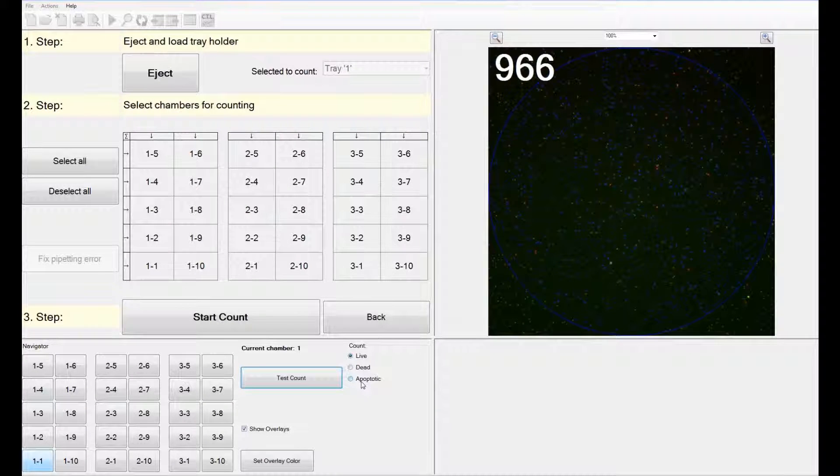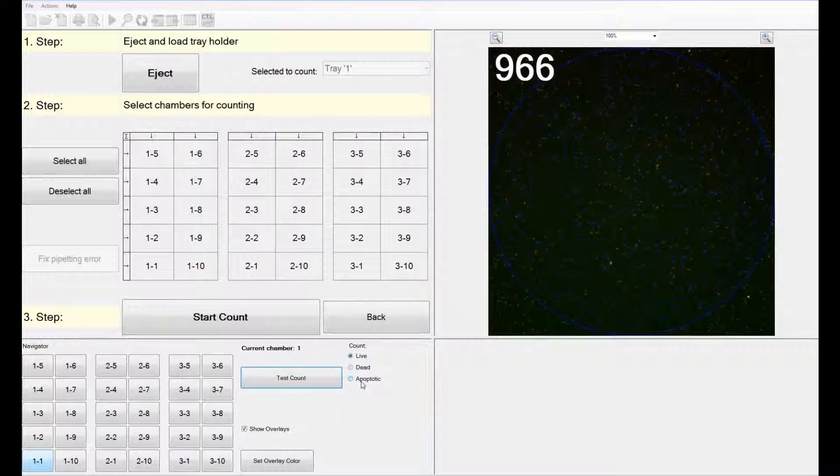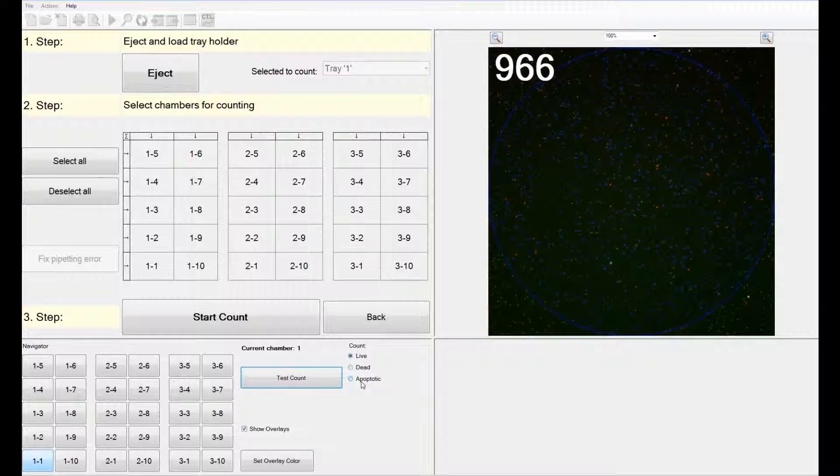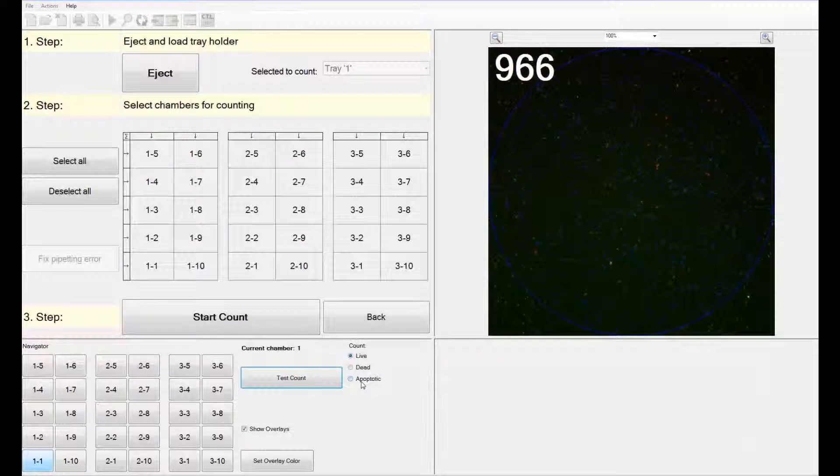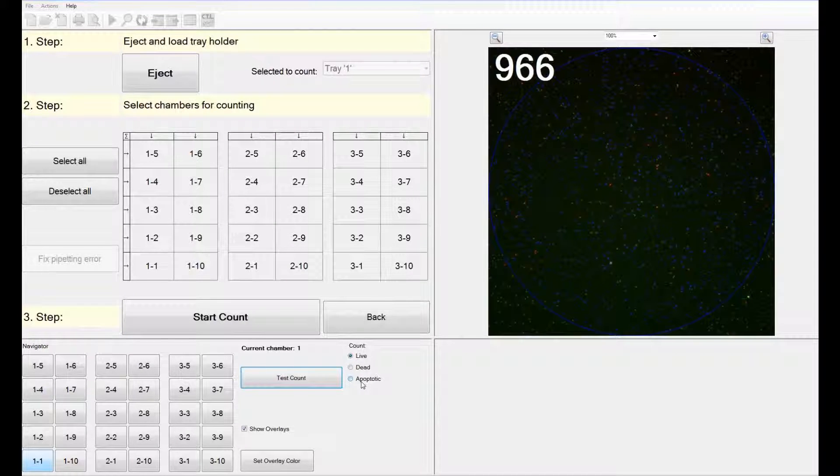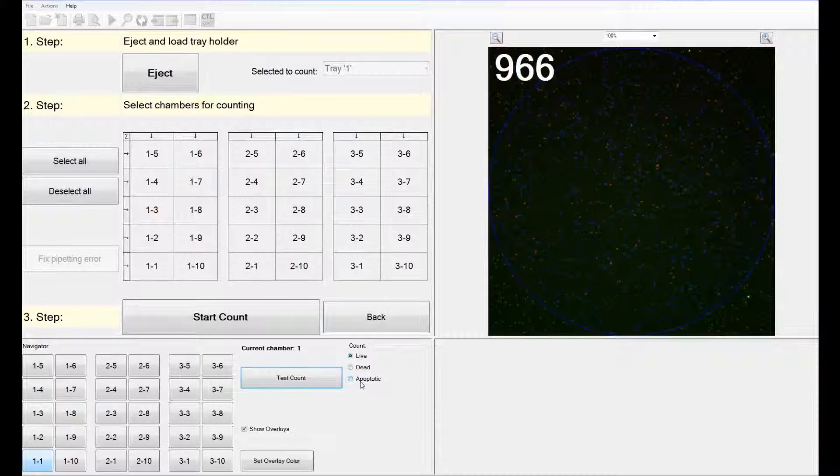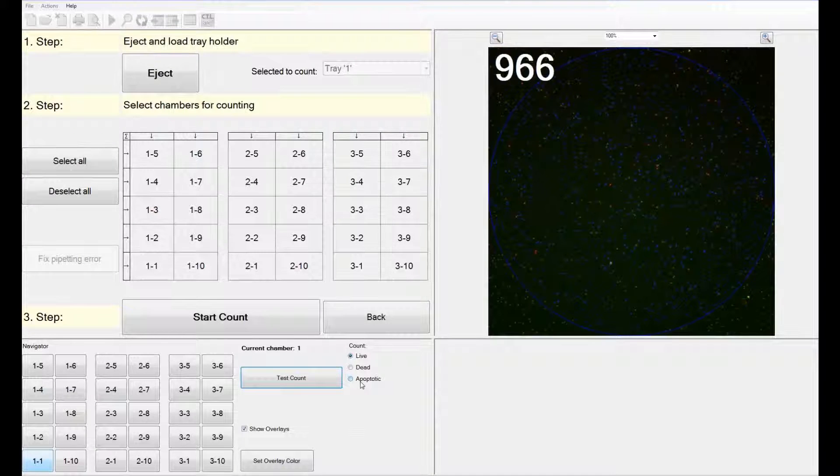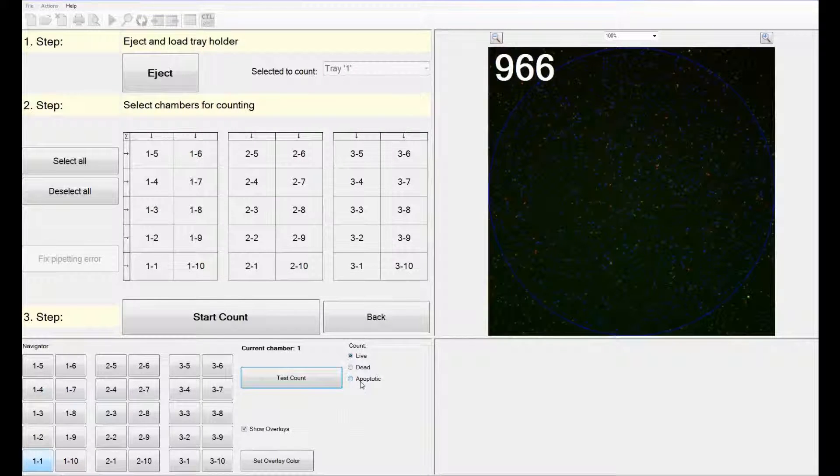You can repeat this for the dead count or the apoptotic count as well. If you have preloaded sample IDs, the wells corresponding to your sample IDs will be automatically selected. If you do not have any sample IDs, which is what we did, you will have to manually select the wells you are interested in analyzing.